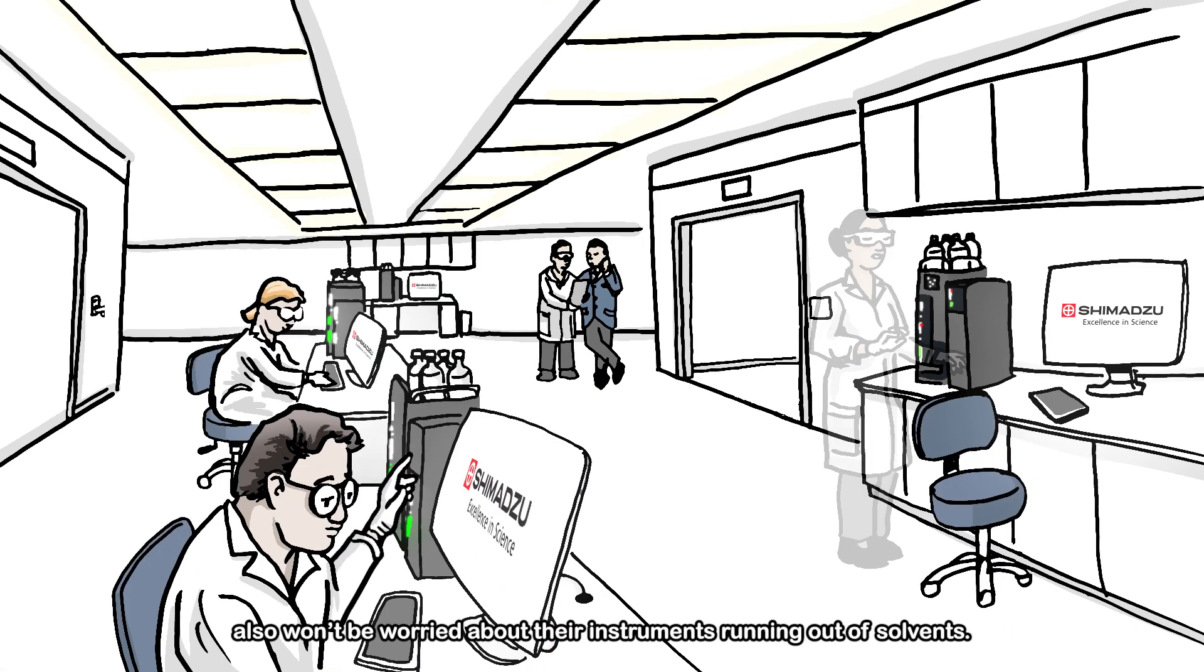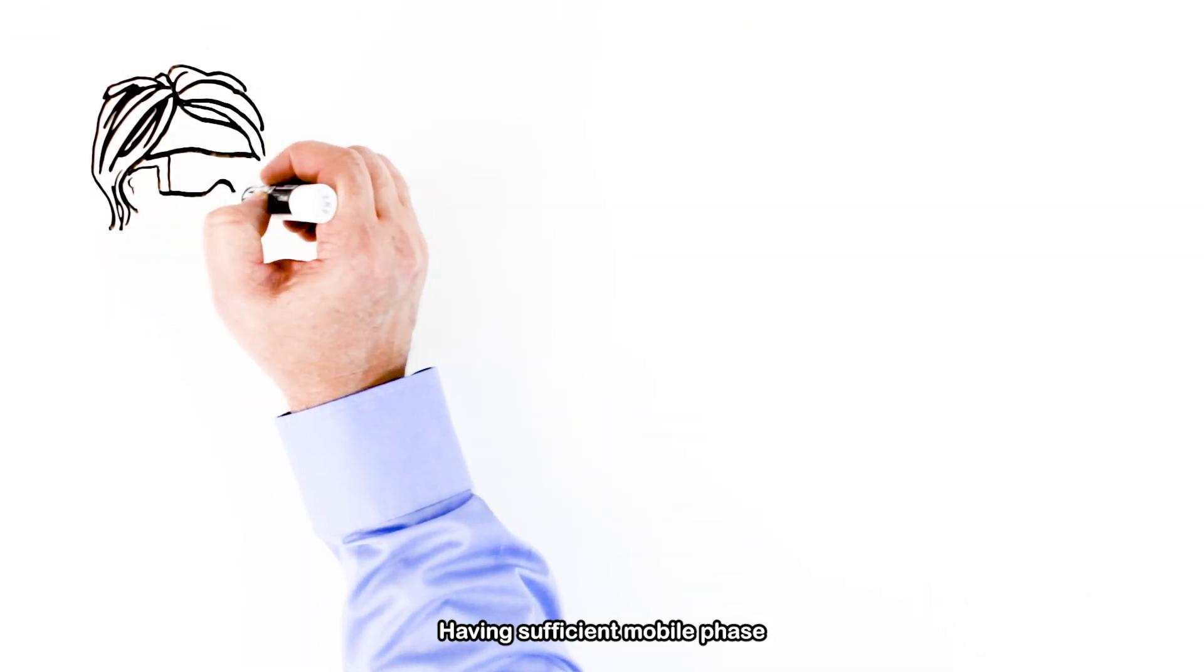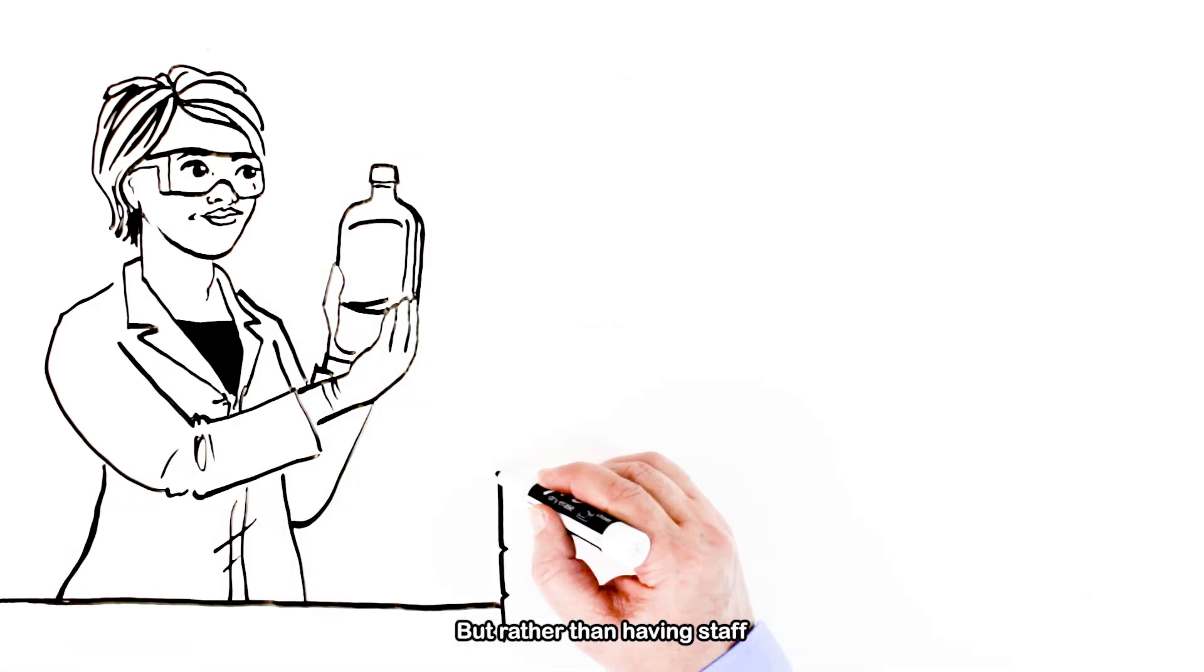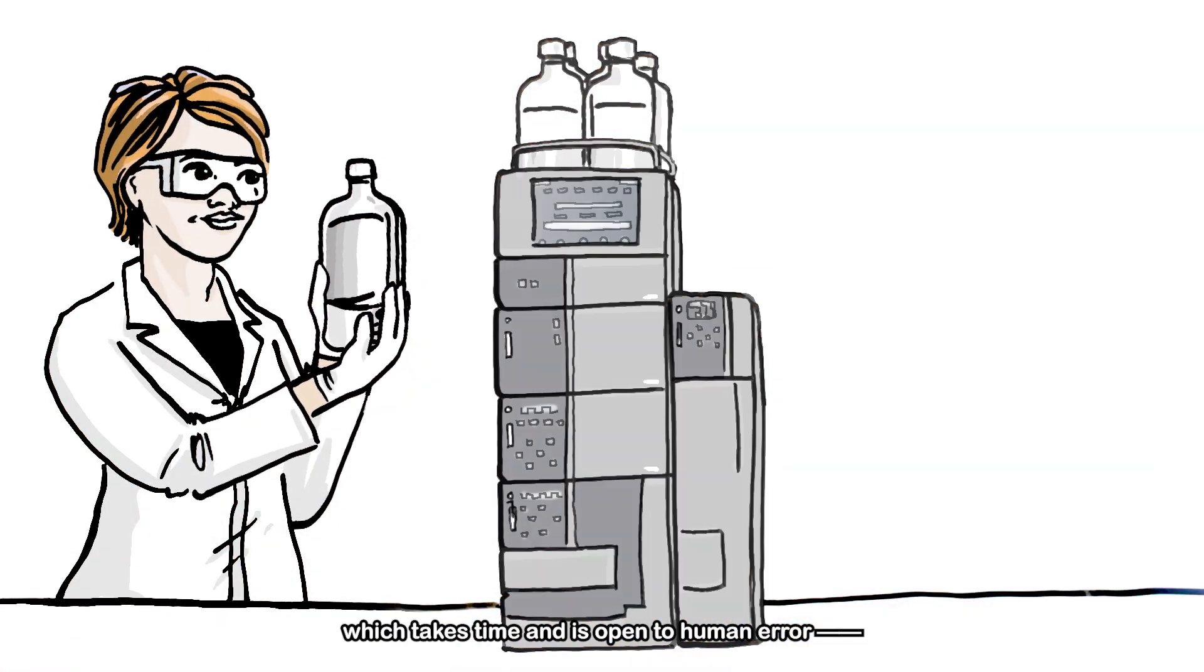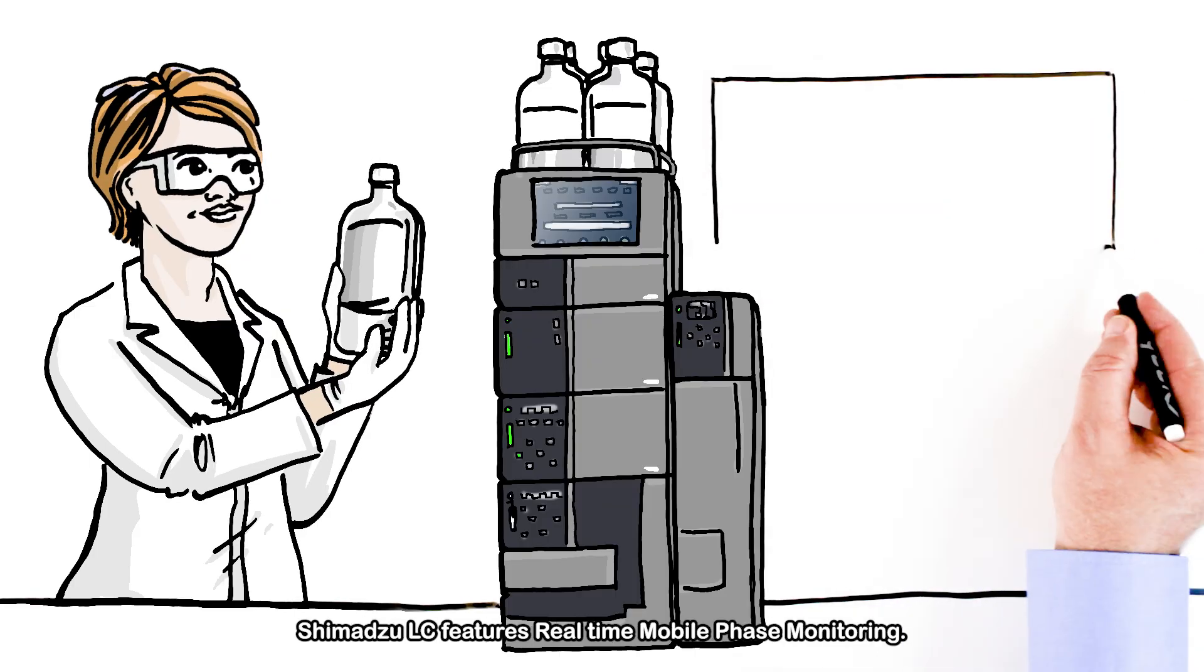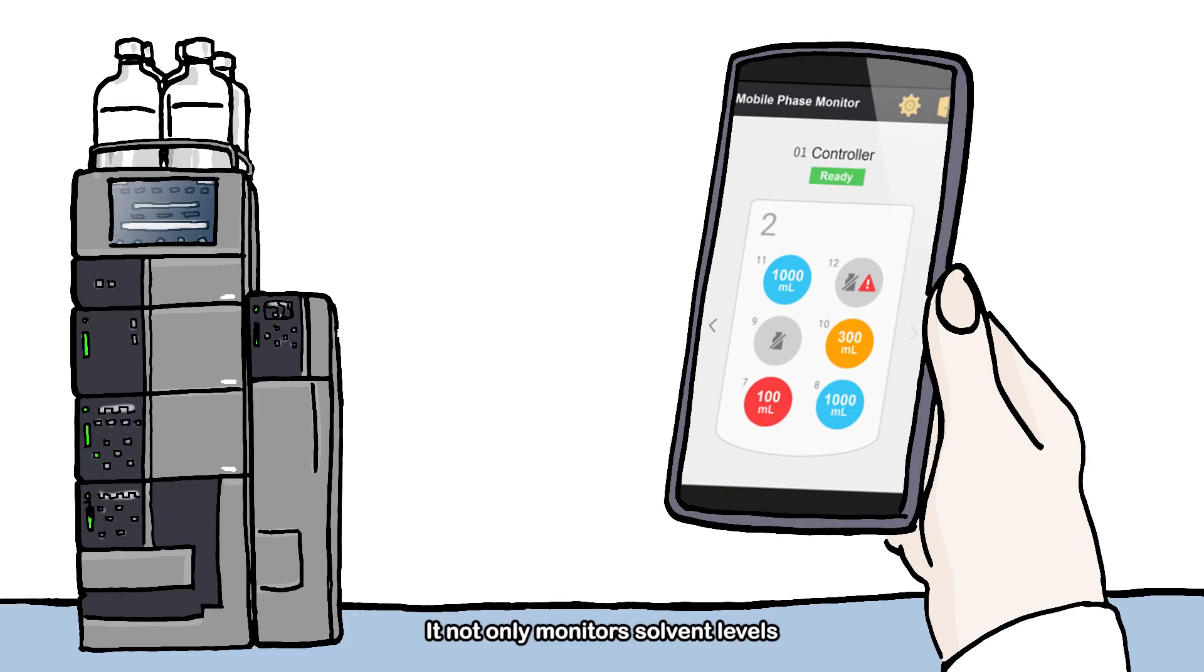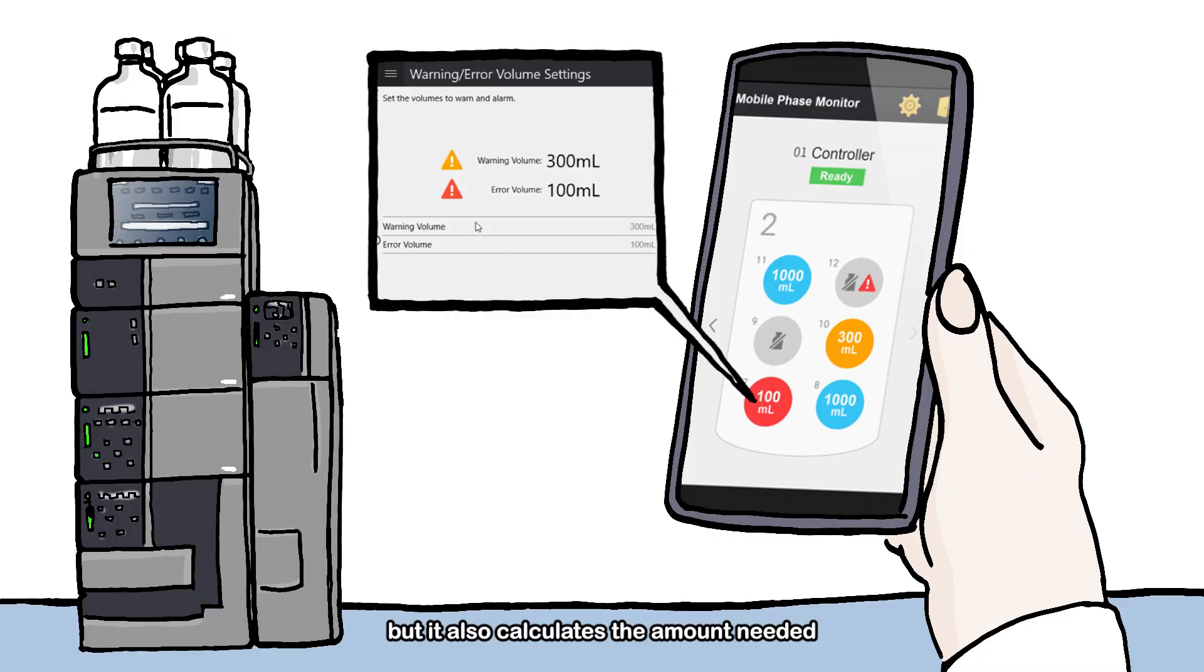As the day moves on, your lab staff also won't be worried about their instruments running out of solvents. Having sufficient mobile phase is critical for keeping experiments running smoothly. But rather than having staff estimate the amount of mobile phase needed for an analysis, which takes time and is open to human error, Shimadzu LC features real-time mobile phase monitoring. It not only monitors solvent levels and sends a notification if there isn't enough mobile phase to complete an analysis, but it also calculates the amount needed and ensures sufficient levels before even starting a run.